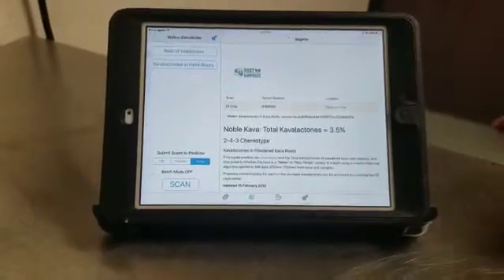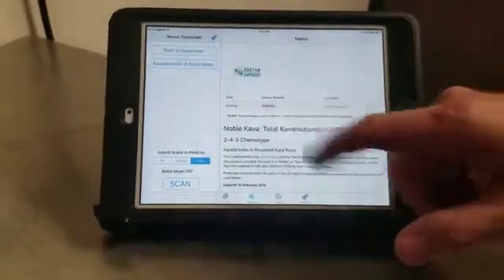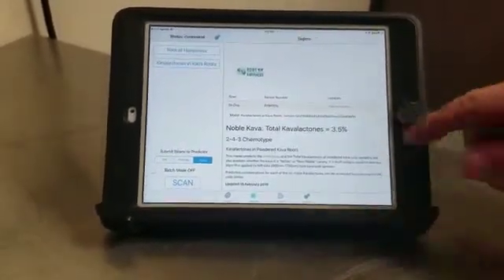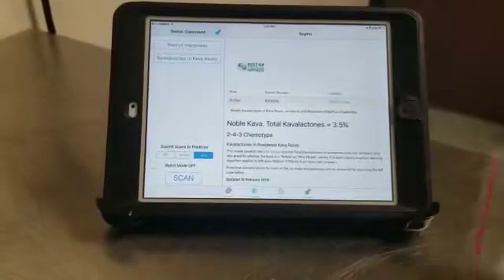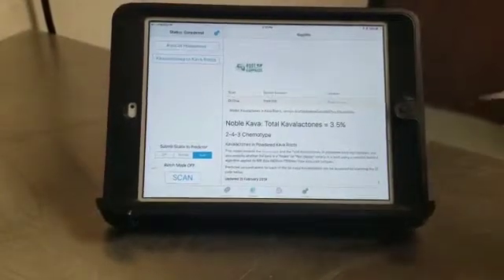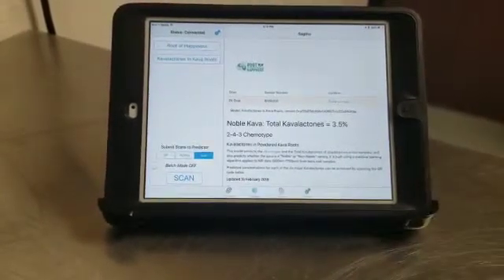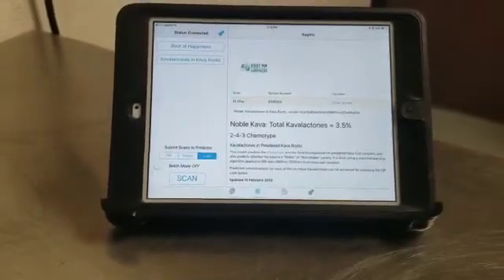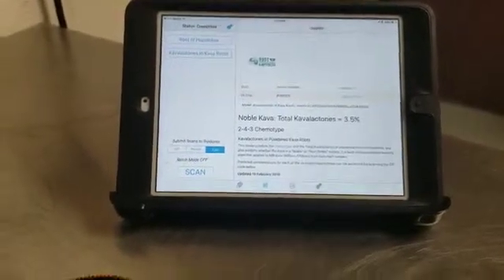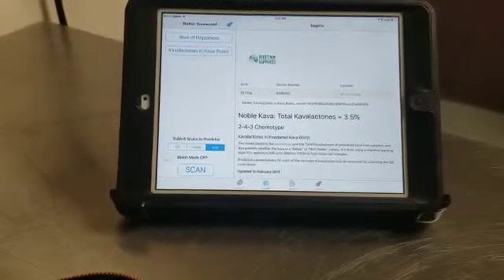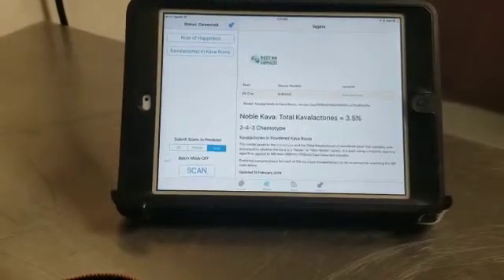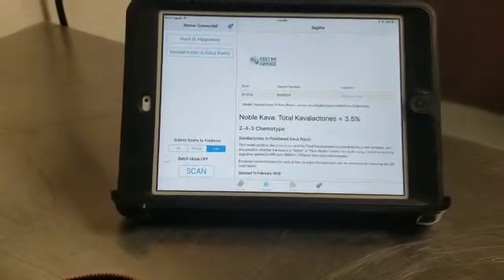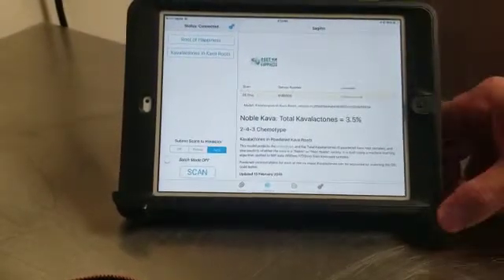Here we are. So, we know that it's Noble Kava. It's 3.5%, which is about right for peeled chips. And it's a 243 chemotype, which would be a Vanuatu Barogu. That's it for now.